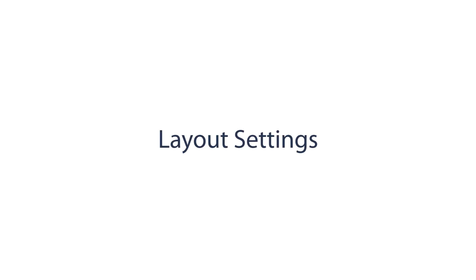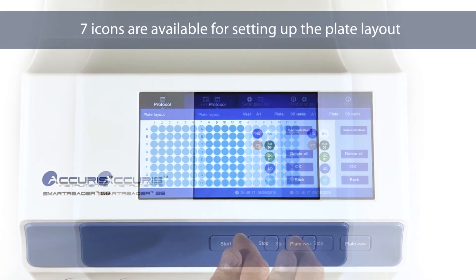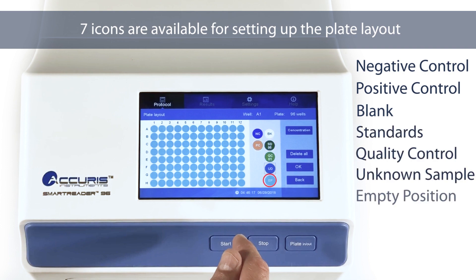Layout Settings. Press the Layout section to designate the well settings across the plate. The seven icons on the right side are the choices for each well setting: Negative Control, Positive Control, Blank, Standards, Quality Control, Unknown Sample, or Empty Position.